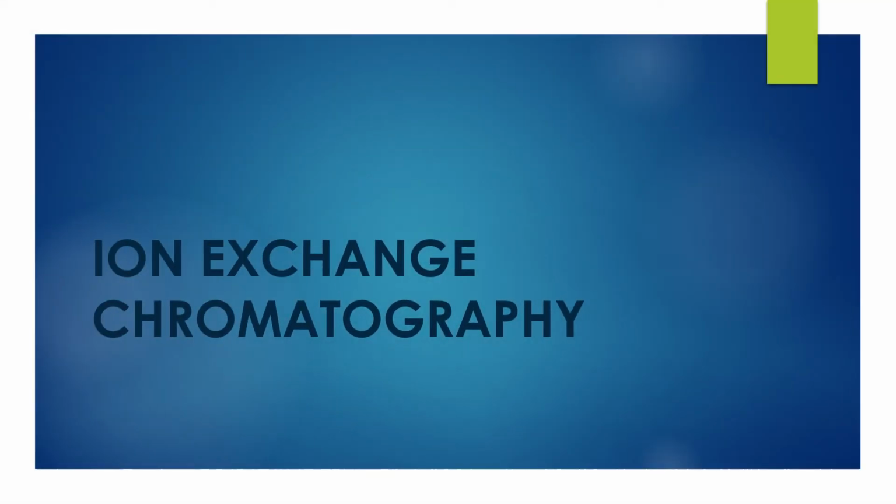In this video, I will talk about ion exchange chromatography. This is a special kind of chromatographic technique. Like other chromatographic techniques, we have two phases, stationary and mobile. Stationary phase is the solid phase and mobile phase is not the solid phase. It can be either liquid or gaseous.